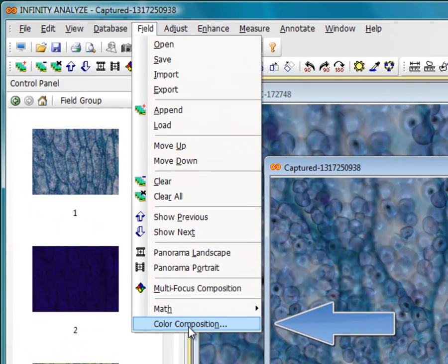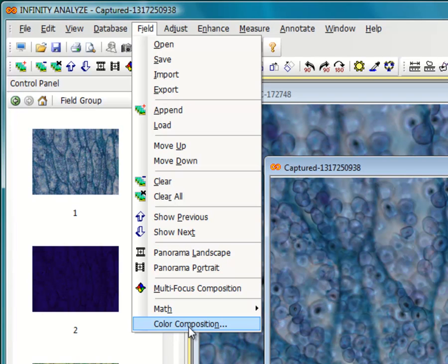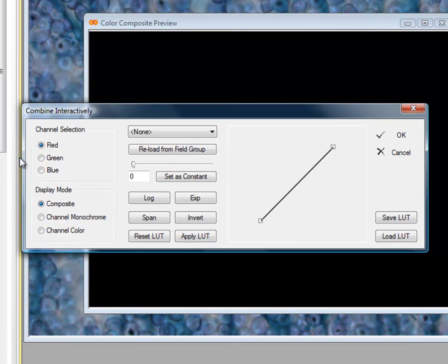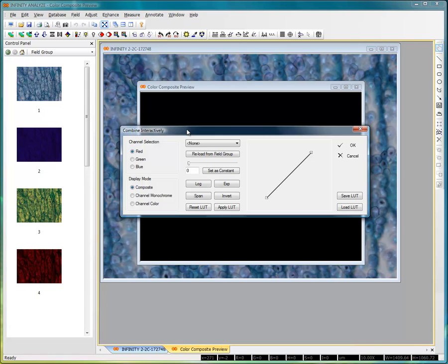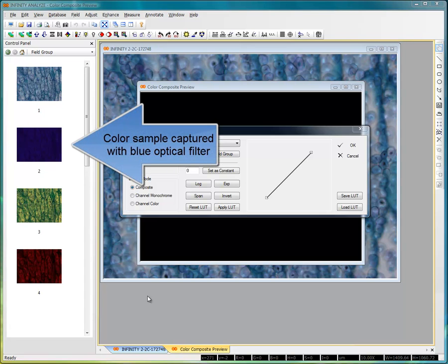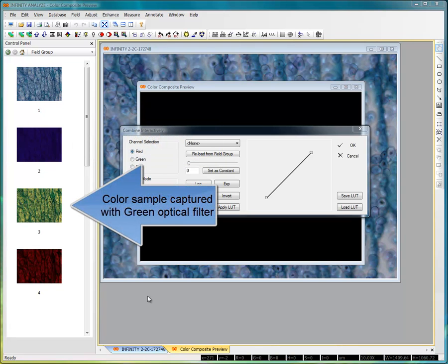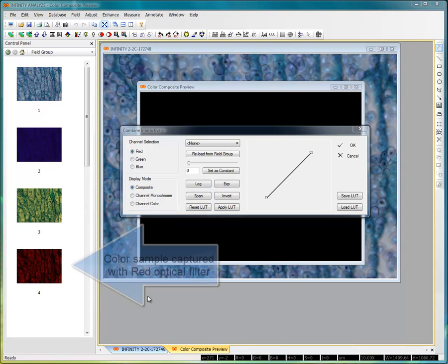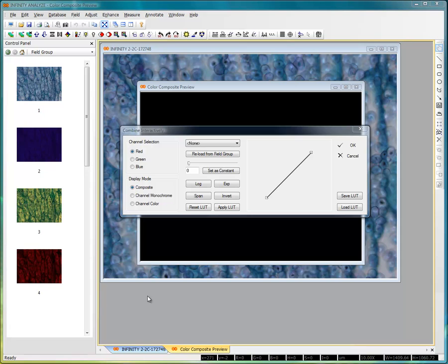I went down to the field menu — the last option is color composition — and selecting that brings up the combine interactively, or color composition, dialog box. I'm now going to walk through the features and functions available on the color composition panel and explain what I'm doing as I go along. The results here are a somewhat artificial exercise. I'm selecting from images captured using a color camera with different filters turned on on my microscope, and I'm going to reassemble those images with some enhancements applied. A little later in this tutorial, we'll work with monochrome images also captured from this sample using different filters, so you'll get an idea of how the same process can be applied using monochrome cameras.